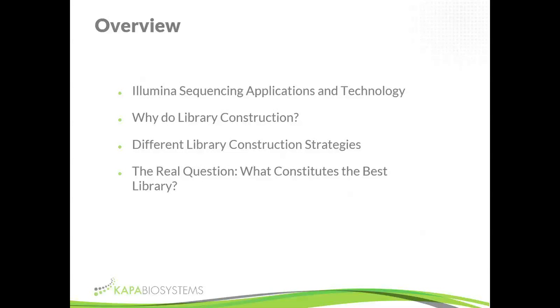And so during the course of this first part, we're going to keep on answering this question: why do we do library construction? And so from a practical point of view and also from a more philosophical point of view, we'll briefly look at different library construction strategies, and then end with the question to lead into part two: what is the best library I can make? And then in part two, we'll continue and say, but how do I make that best possible library?